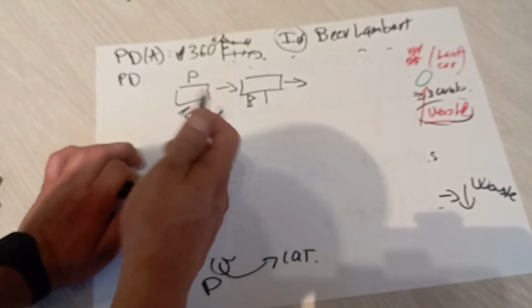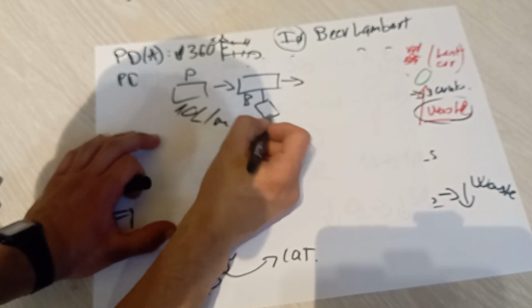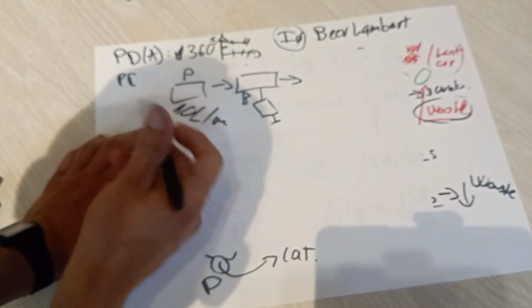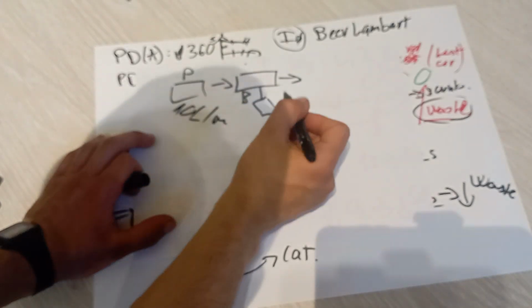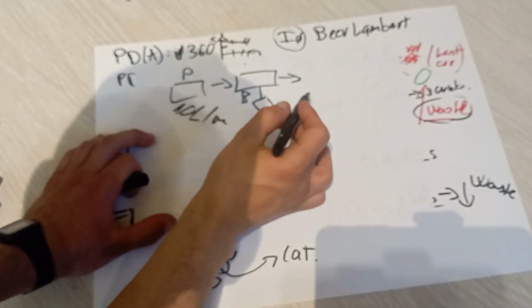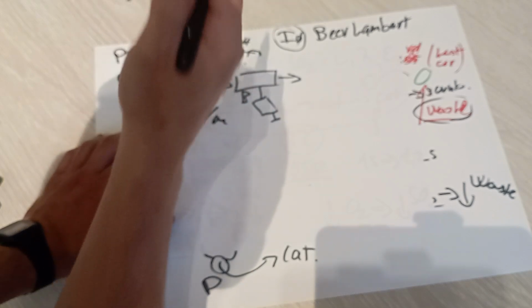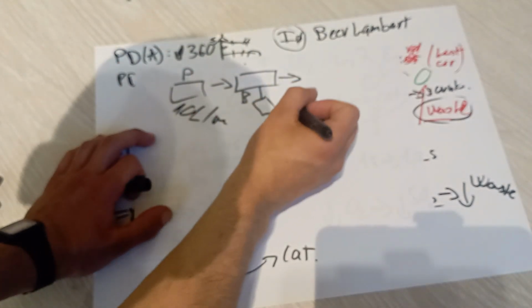This is way too much for me, and here there is a valve that is adjusted with a little tunable, turn-in type of dial, and it is a membrane thingy that if you turn it in, you lower the pressure needed for it to open.